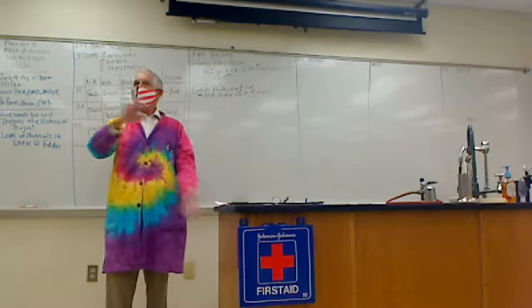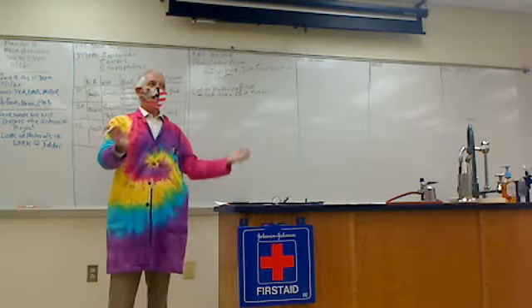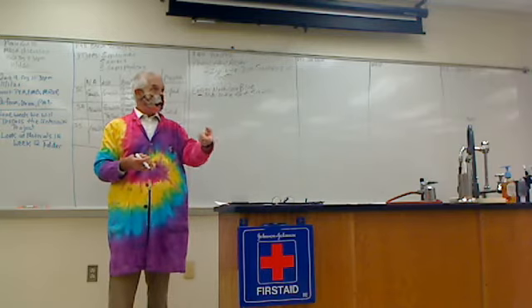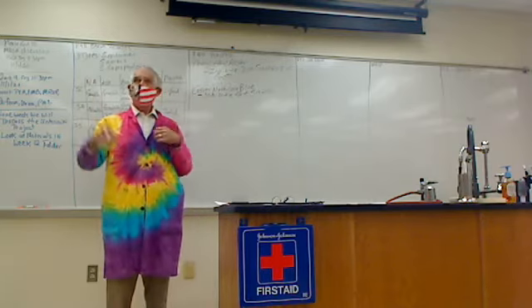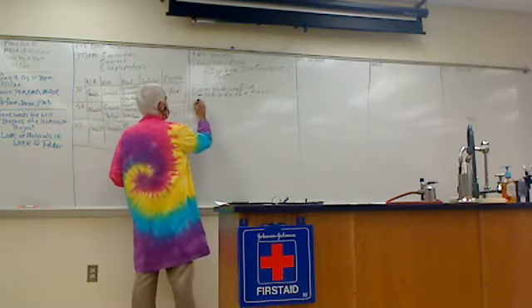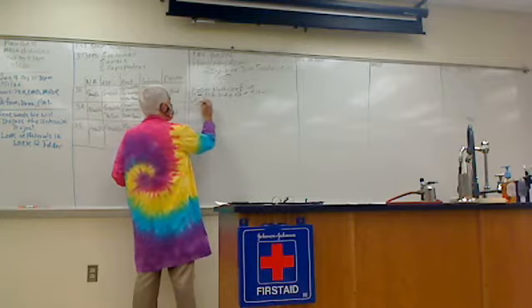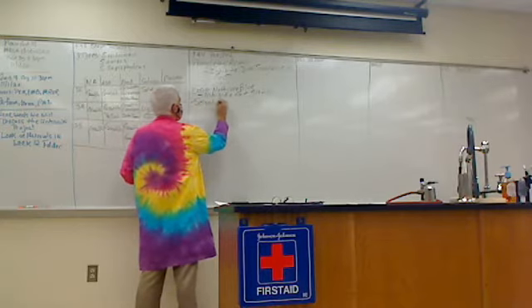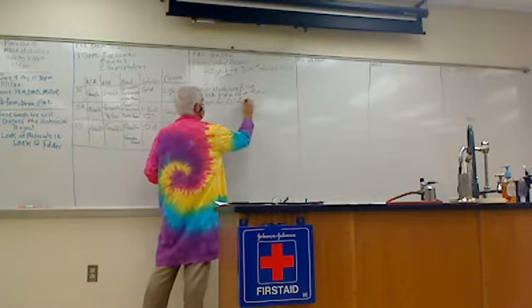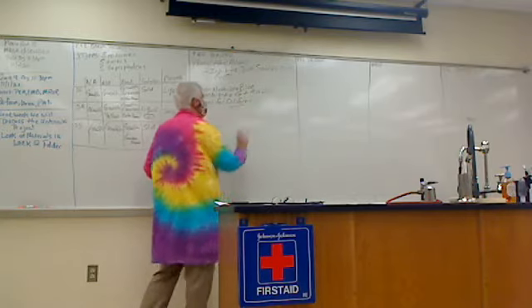So these are really a good way to double check your gram stain, isn't it? It's another way to verify whether you have gram-negative or positive. So can we say that they select for coliforms? So that's a good term to know, coliforms.